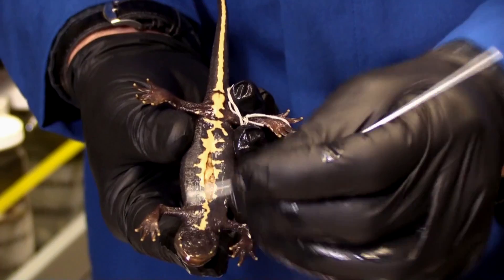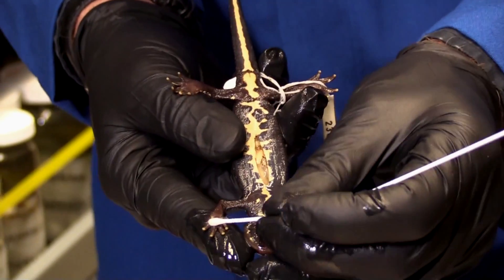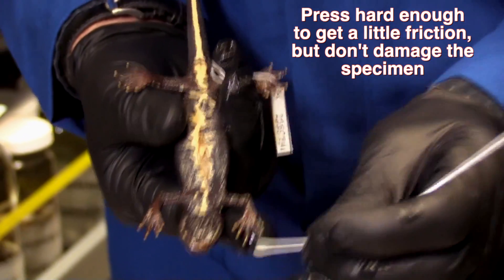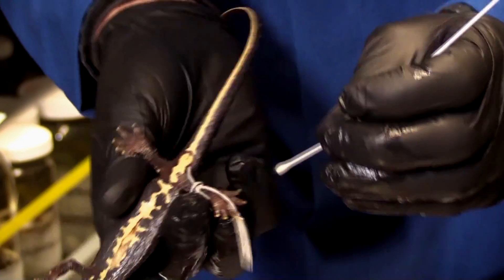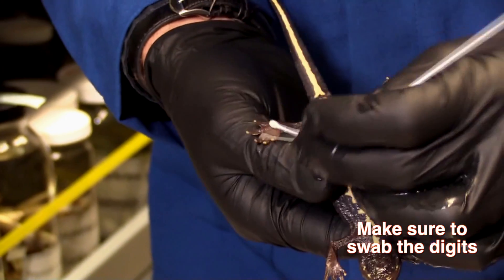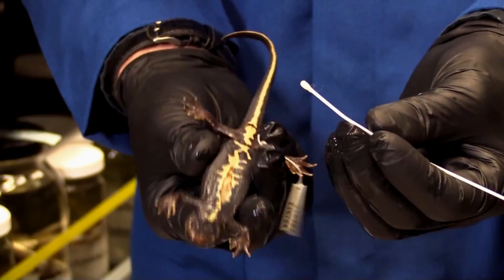I want to be especially careful — I'm not going to swab the tail because I don't want it to break off. You don't want to push too hard; you do not want to break the skin of the specimen. You want to be gentle, but vigorous enough to get little pieces of tissue coming off. Now I'm going to do the last few strokes on the toes, because we know that's an area where chytrid fungus tends to be more commonly found, even at low concentrations. That's about 30 strokes, maybe a few more, and I'm done with this specimen.